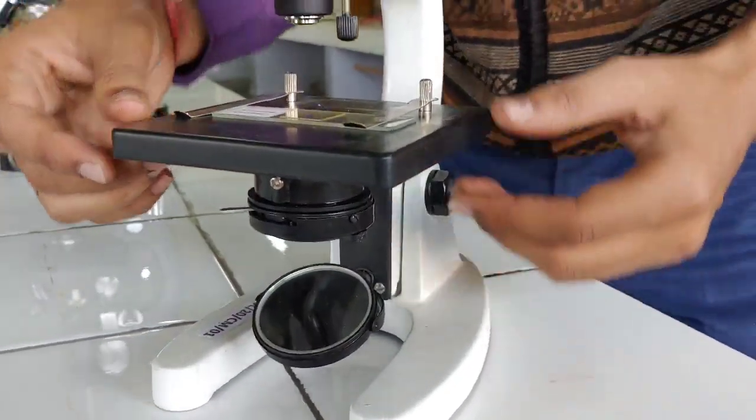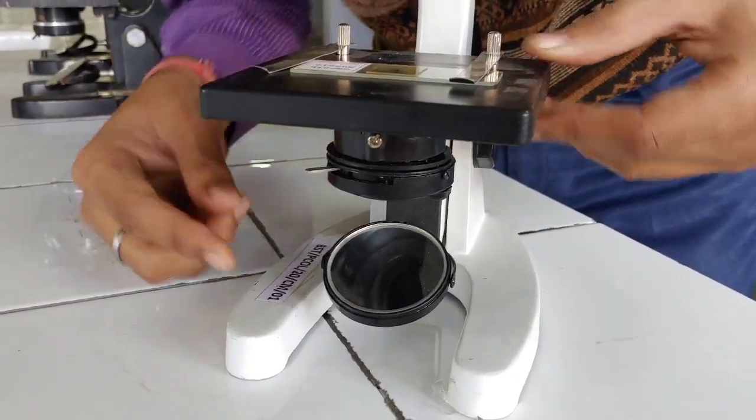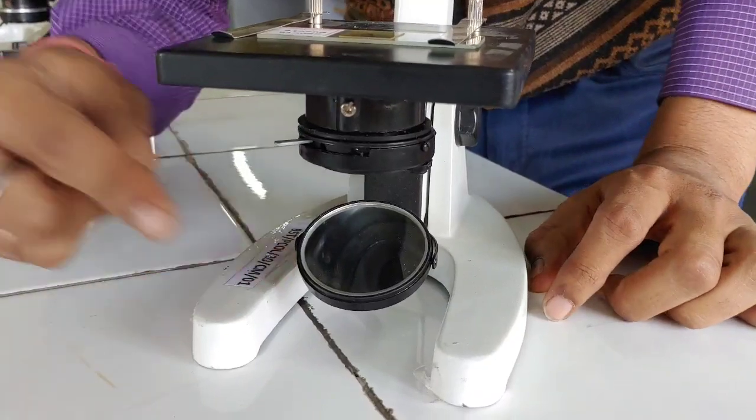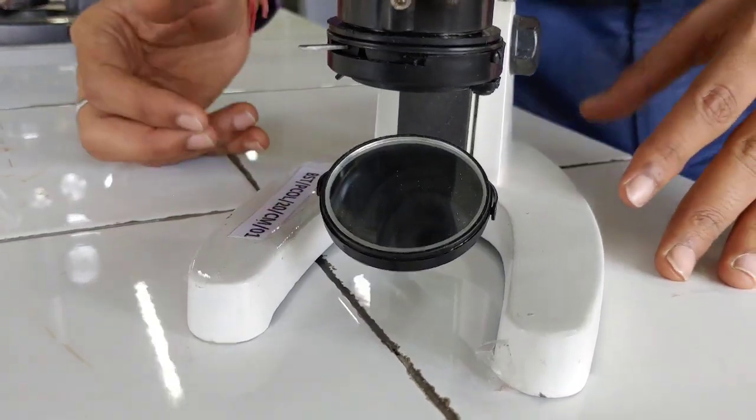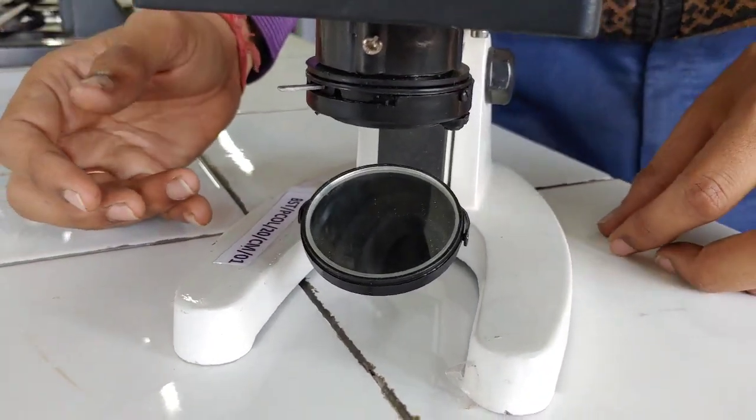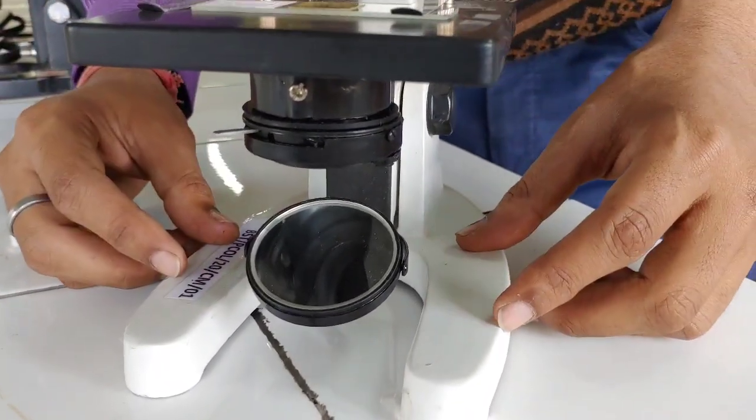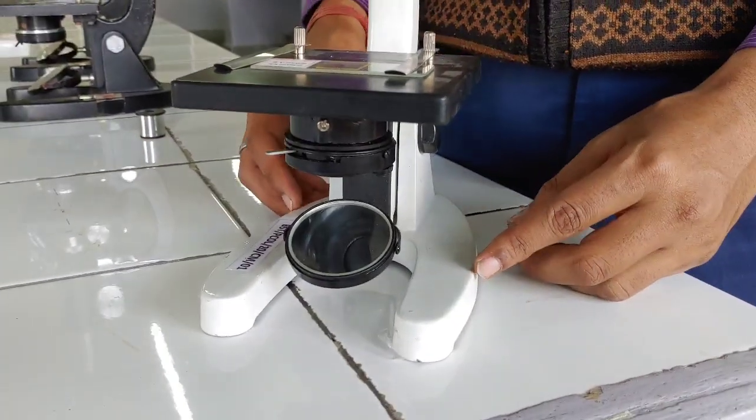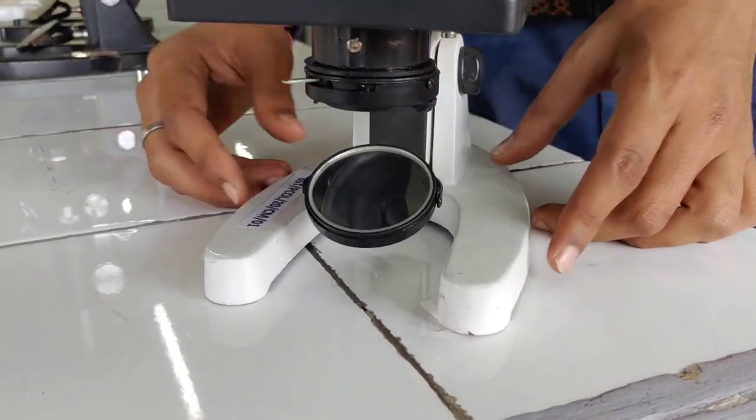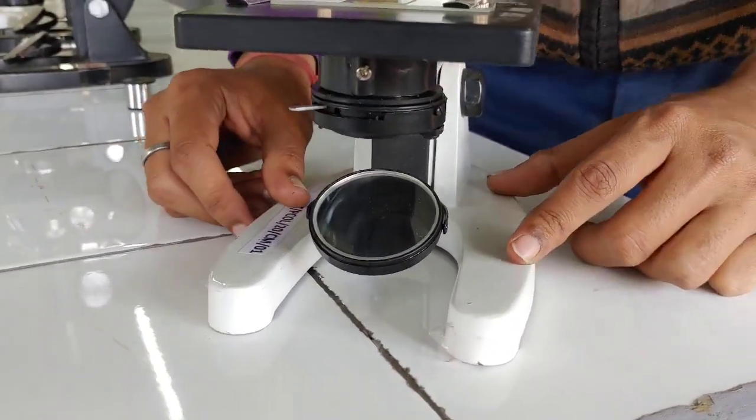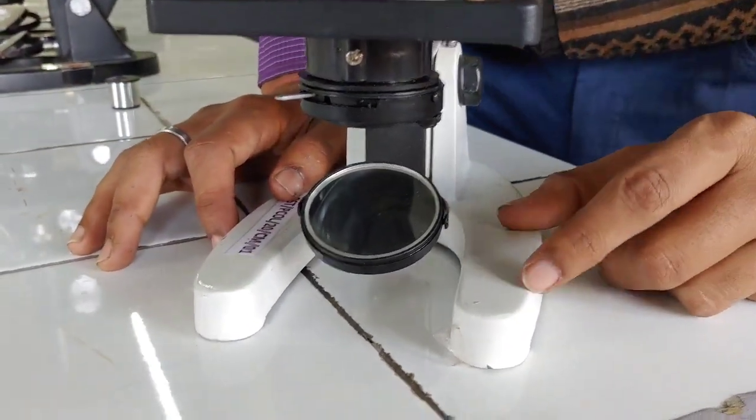Now, the next component is the illuminating system. First is the source of light. It is a system which may be external or it can be internal. External can be your daylight or electric lamp or tube light. Or internal source can be the inbuilt light source. In this basic compound microscope, this is not present. Only the external light is acceptable here. But some modern microscopes are there where you can use the inbuilt screen or source of light.